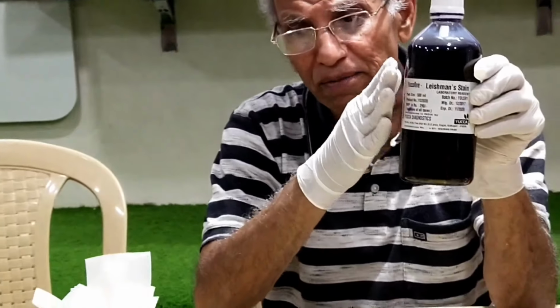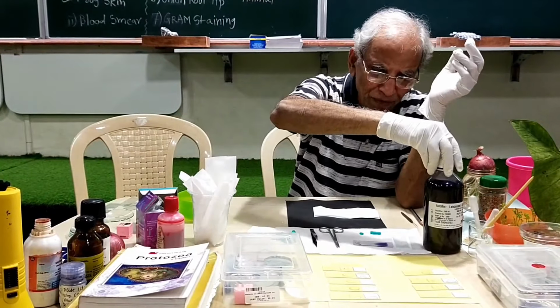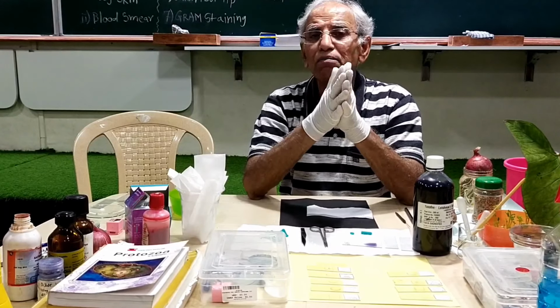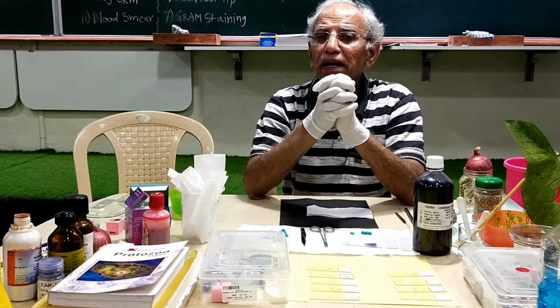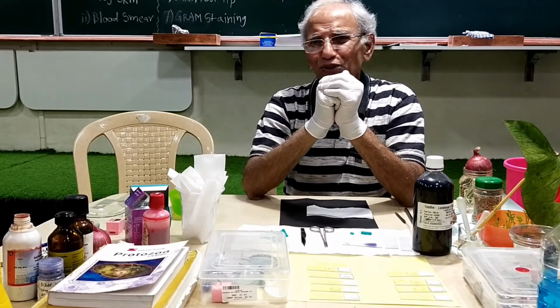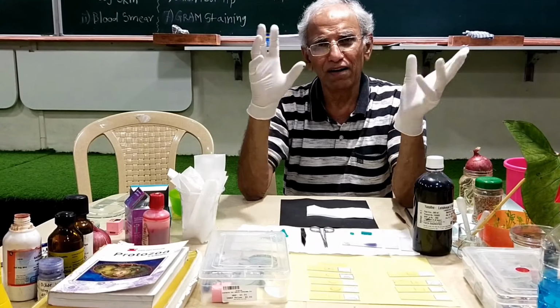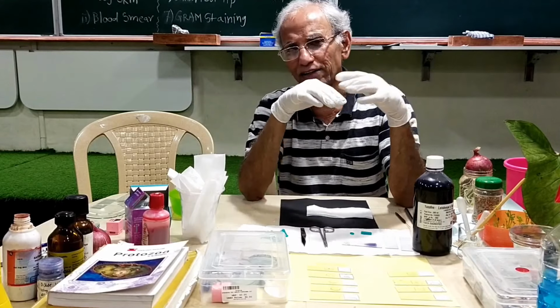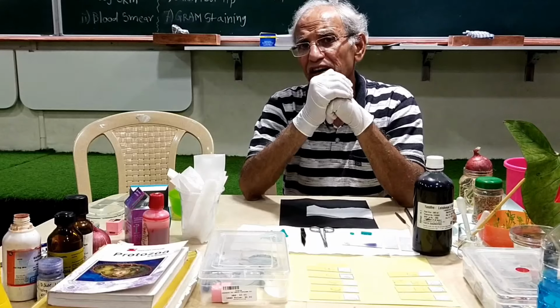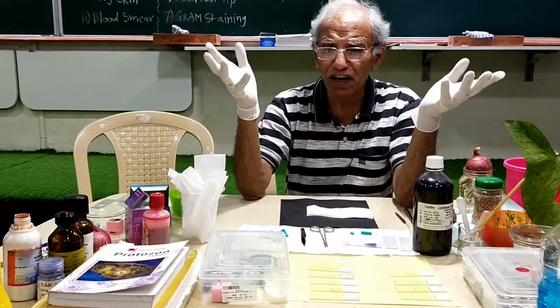But then let me say a few things about this particular method. Leishman was a great person in the British Army. He was a medical professional in the army and he was a pathologist. So naturally he had a background of the military as well as medical science. And then he's the one who started around 1900. More than 120 years back, he started with this particular procedure and it is very much used even now.